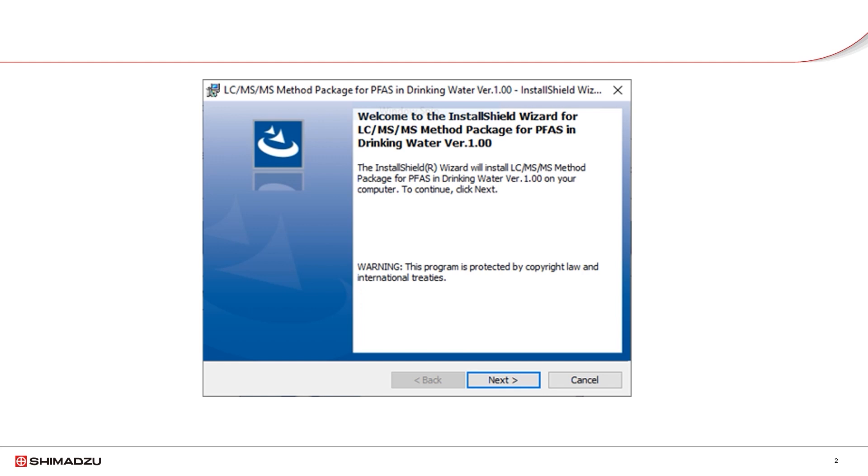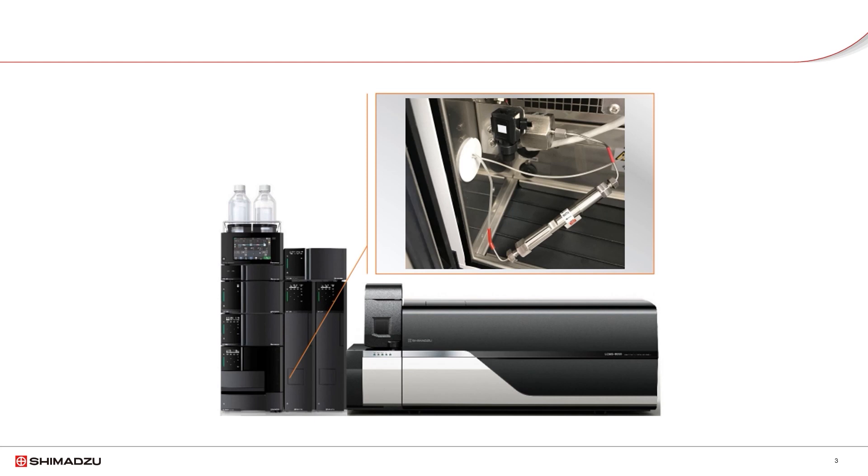Installation of the software will provide the method files. Connection to the delay column is the only hardware needed for installation.